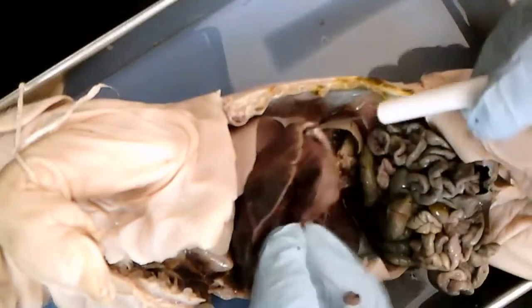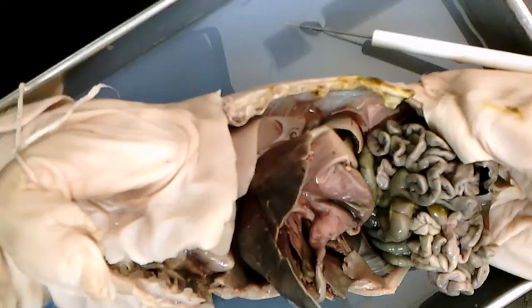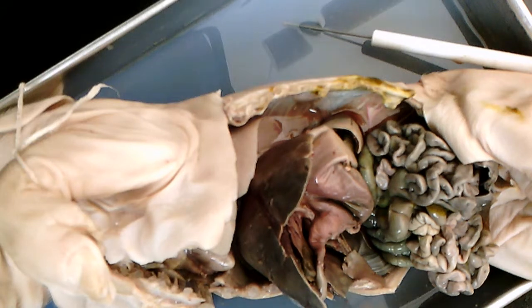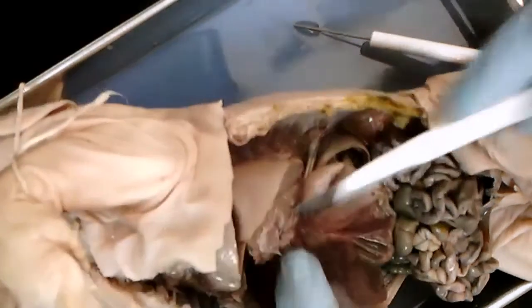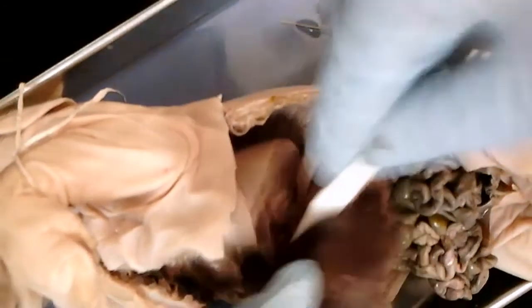I think I cut through the pancreas. What I will do for you is put on the website a list of all the organs that could potentially be on the CDE for your students to identify. But when you're helping your students with this, I would have them start to cut organs out, take the lungs out, the liver out, the heart out, and actually look at them very well. I'll take just a little bit of the liver out just to show you. It's all very simple to do.